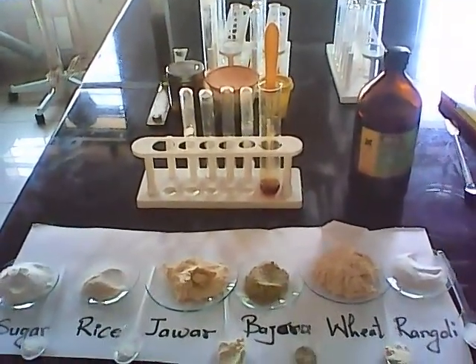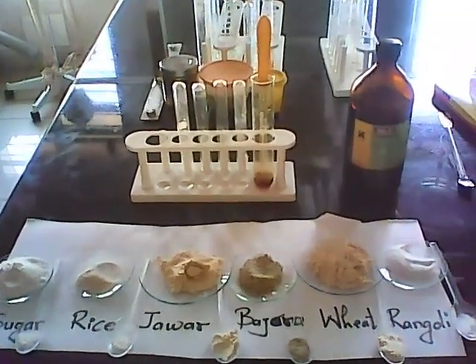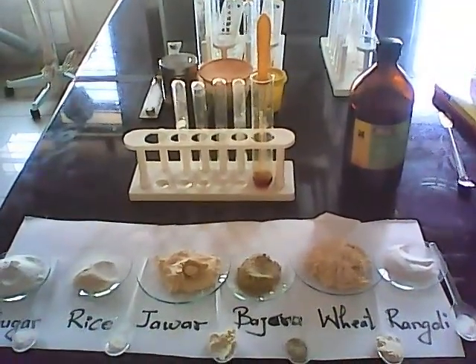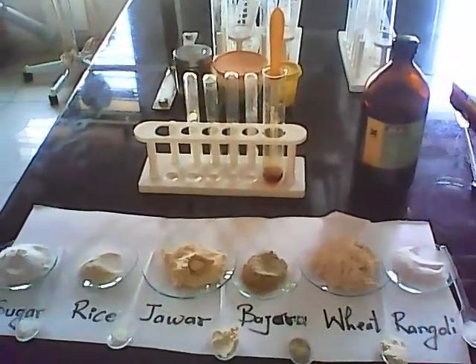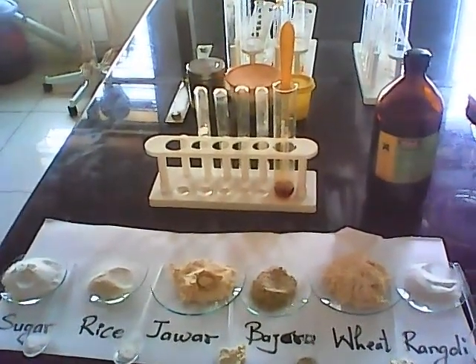And to detect presence of carbohydrate we have iodine solution which is in the bottle, and in the big test tube, you can see a dropper is there. In that iodine solution is already taken for the detection of carbohydrate. Now I will start performing activity.